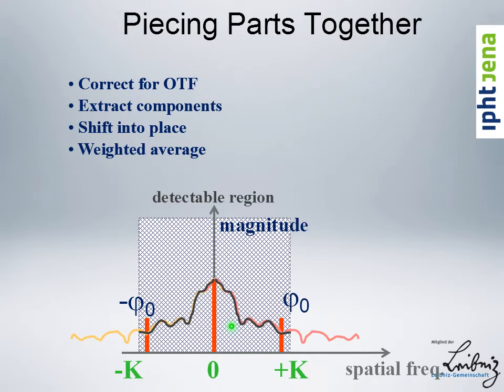The weight would be going all the way to the gray curve here, 50-50 to these two curves here, and all the way to the pink curve here, and from then on it would just be the pink curve. And of course the other way around with the yellow curve here. But you might realize there's a big problem here because the noise would still be infinite at this end of the pink curve, and therefore what you do is you make sure that this curve goes back to 0, and this way you're fine and the noise is killed as well.